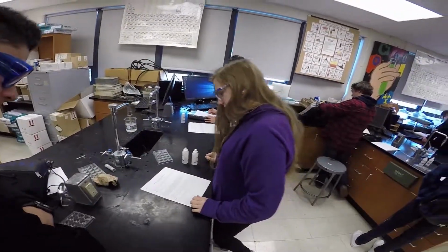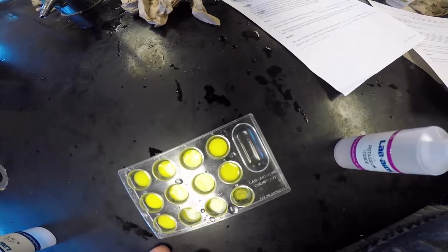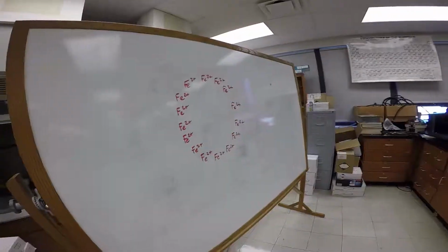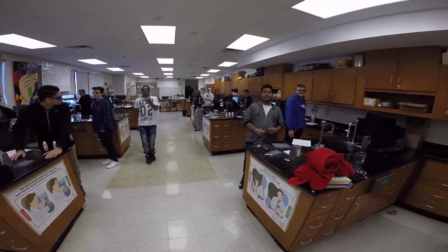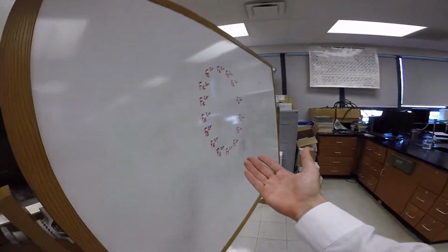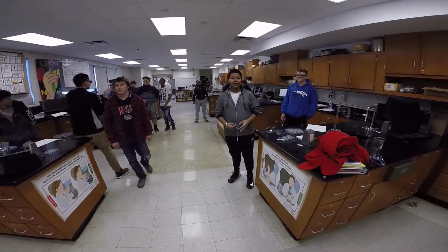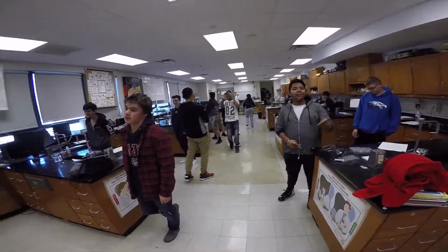Alright, what's the next step? 6 to 6. So if you hold it up to the light, see if you can determine the 6 to 6 is the 1 to 1. This has a name. So I'll give you 10 points if you can tell me what the name of this is. Sean, what's the name of this? Ferric 2. You're close. When you figure it out, raise your hand. Think.